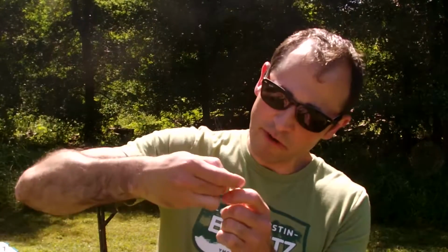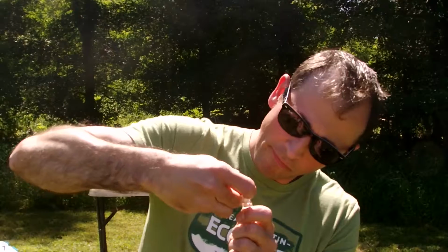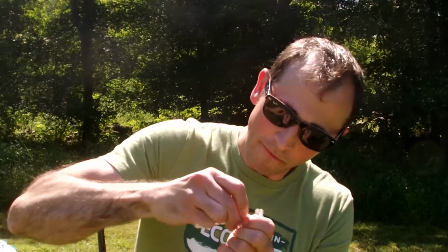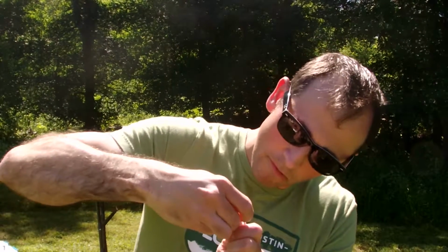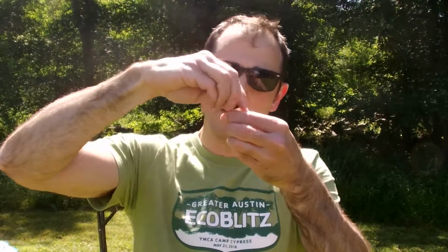Now, this is the easy part, okay? So they have their water sample. You got to have your cap as well, okay? And you're going to pop 2 of your pills in here. Make sure I do this right. There's 1. And there's 2. All right. You cap it. The cap's a tight fit, and you're going to shake it up.